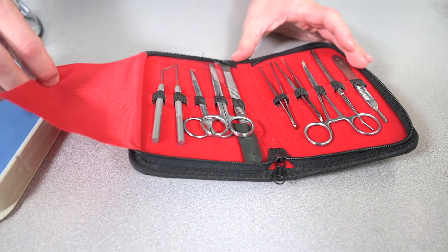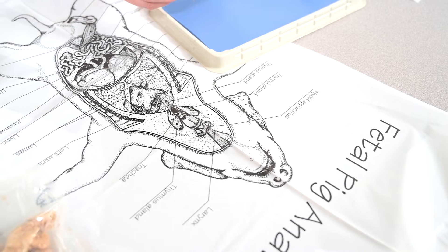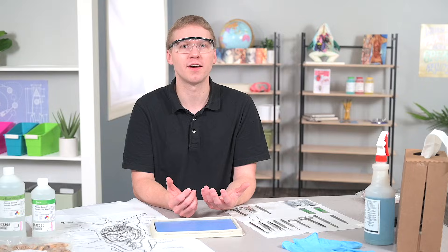That is your quick tutorial on using basic tools and techniques for a safe dissection in the classroom. If you have any additional questions, you can email or call our customer care department or go to our website for more information.